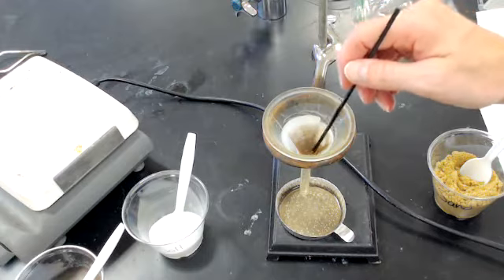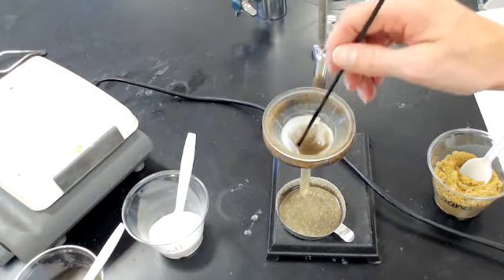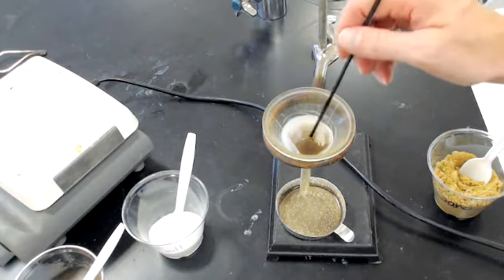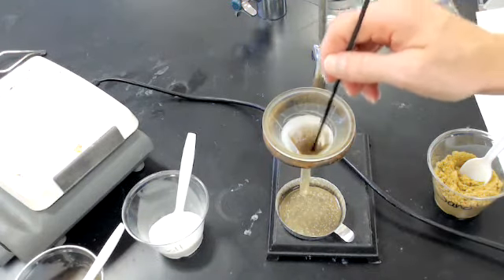I'm giving what's in the filter a little stir, being careful that I don't poke through the filter because that would not help anything. I hope you see how dirty looking my filter is and how clean looking the water in the evaporating dish is.